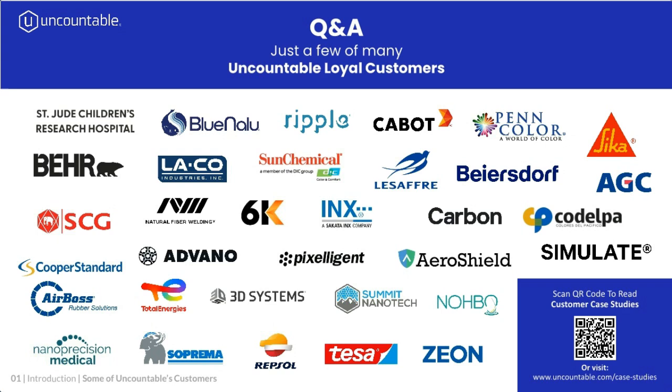So I think the first thing is that we want to really focus on the UI to make it easy for scientists to enter data. The type of data that we're dealing with is oftentimes not obvious to a scientist before they start entering data. And so we're not dealing with just connecting to pieces of equipment. We're also dealing with the type of data that would go into a manually drawn data table in a lab notebook and trying to connect those sources together.